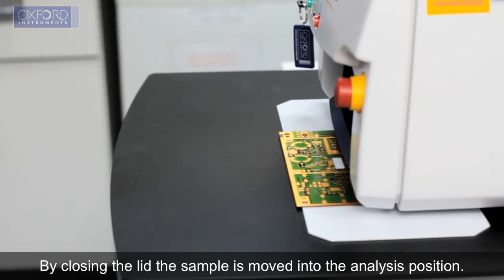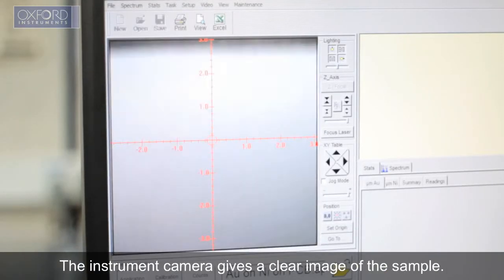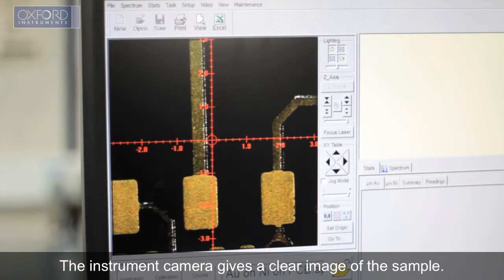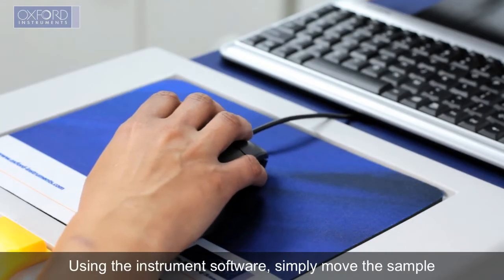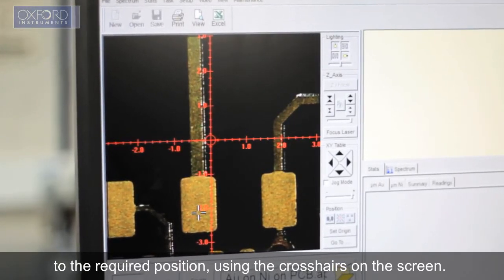By closing the lid, the sample is moved into the analysis position. The instrument camera gives a clear image of the sample. Using the instrument software, simply move the sample to the required position using the crosshairs on the screen.